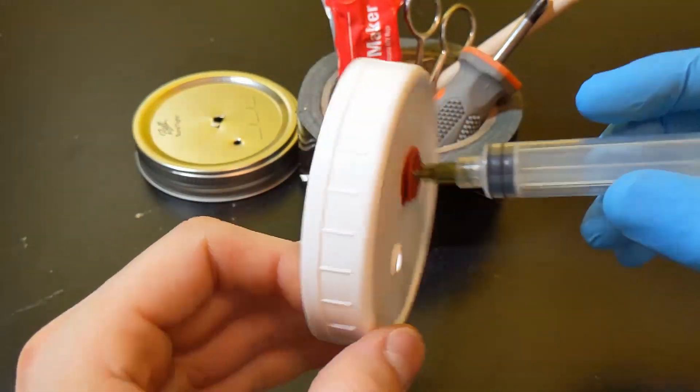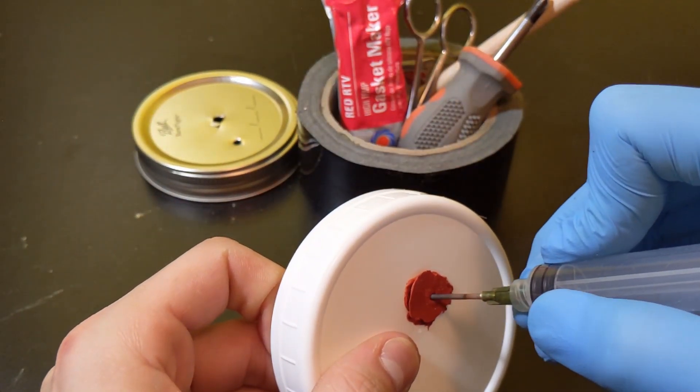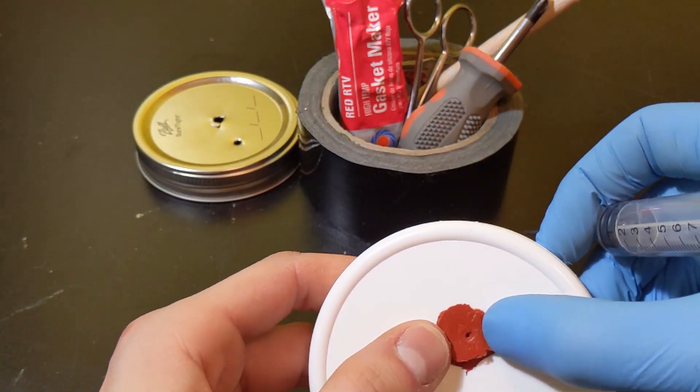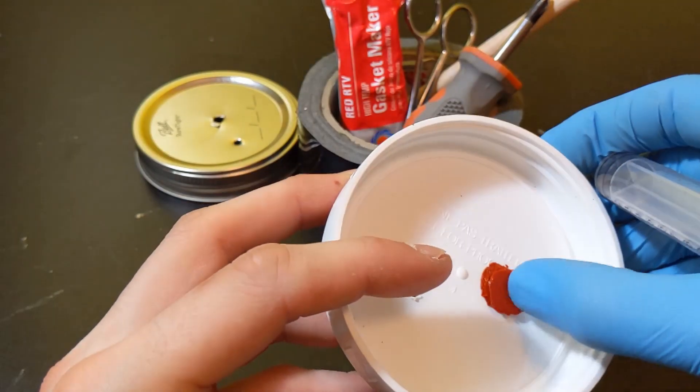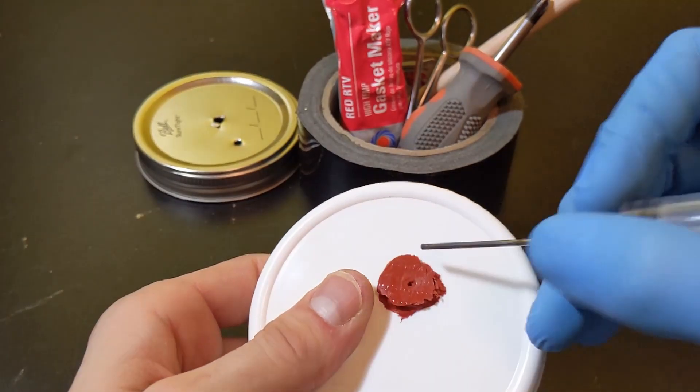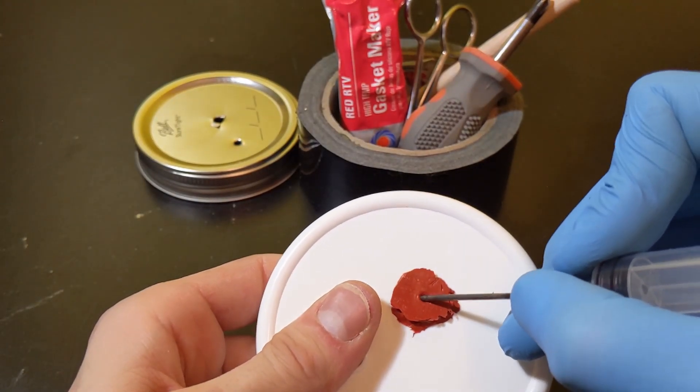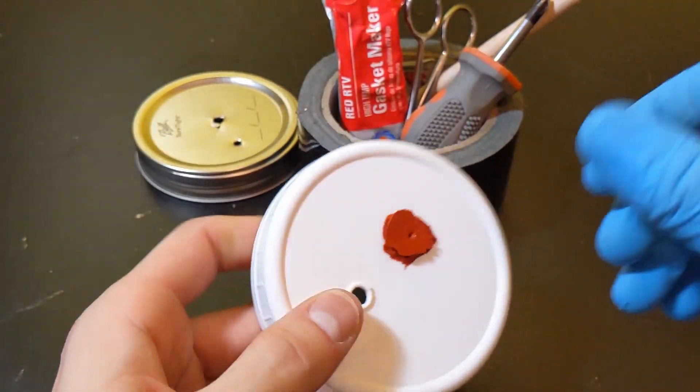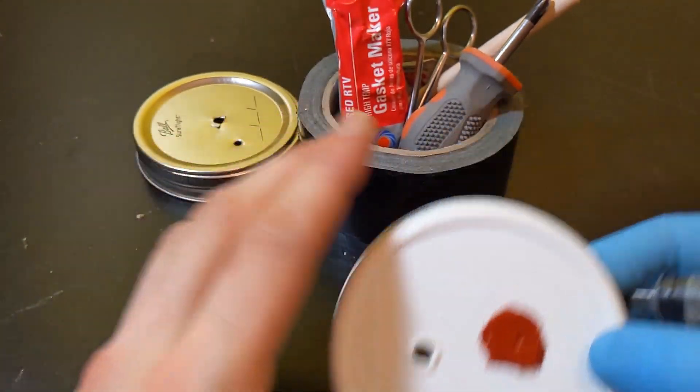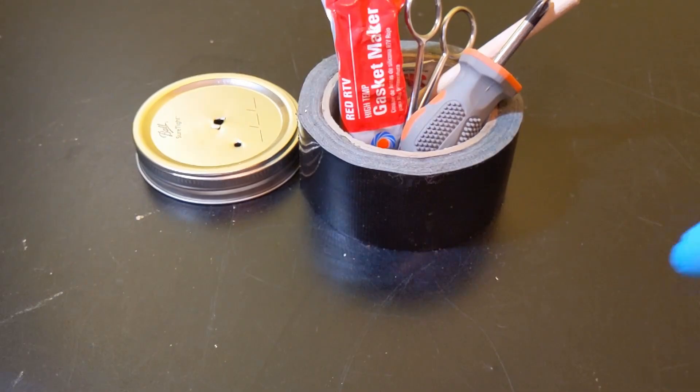So as you can see what this allows you to do is if you're using for example a syringe or like a liquid culture, you can go in the inoculation port and come out and what it does is it will close back up on its own and that really limits the amount of time that there could possibly be contamination. And by adding a second hole we can then add our filter.